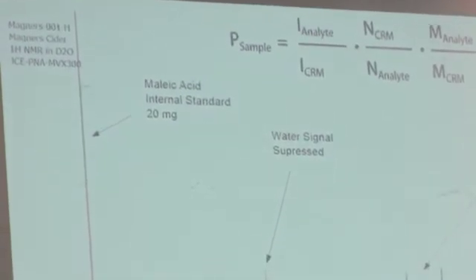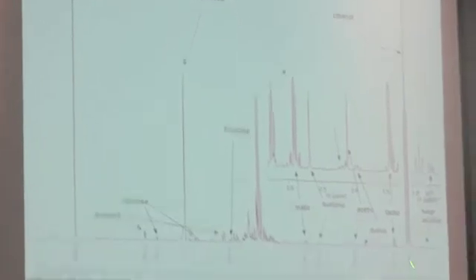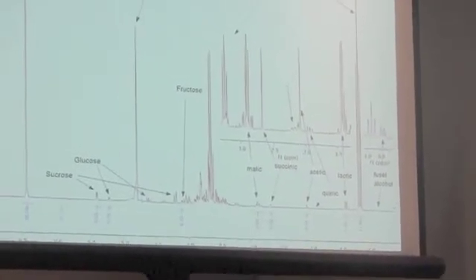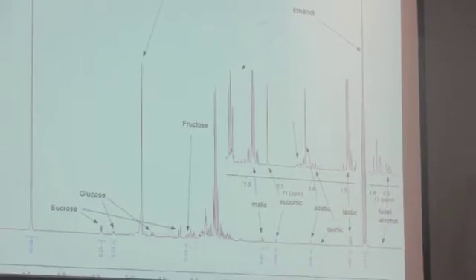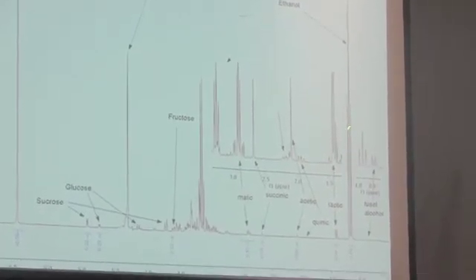So then, if you look at all the good stuff that's in a cider, the kind of things you can see, and these are blow-ups of the area down here. I'm seeing everything at once, and a lot of people look at this and think it's like a chromatogram, which is that GC and HPLC data that you were looking at. In that, every peak is a different molecule. In this, every molecule can give you peaks at different places.